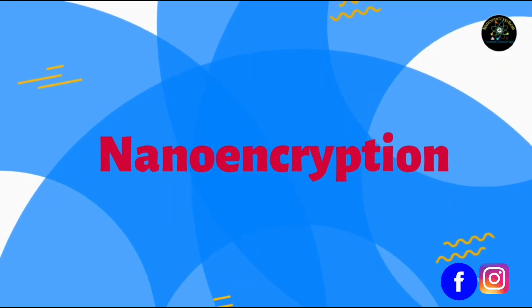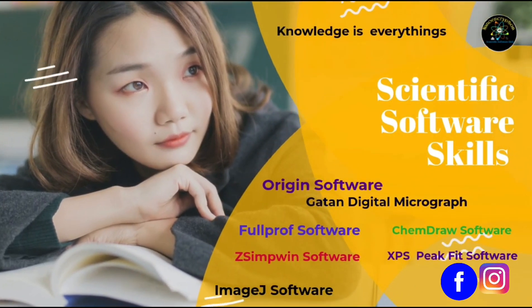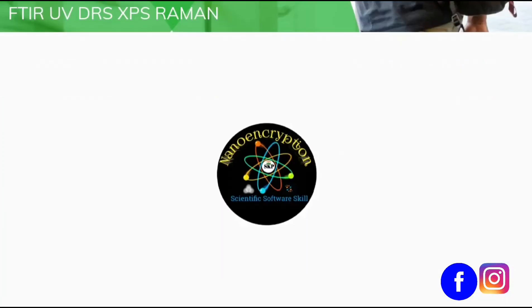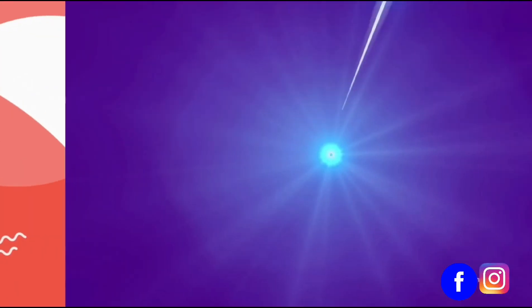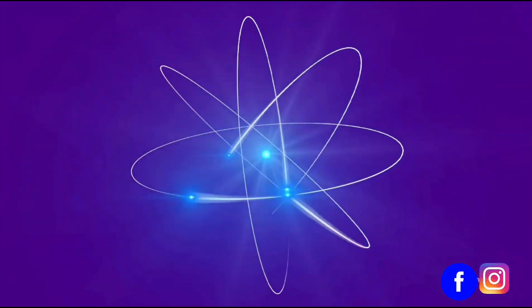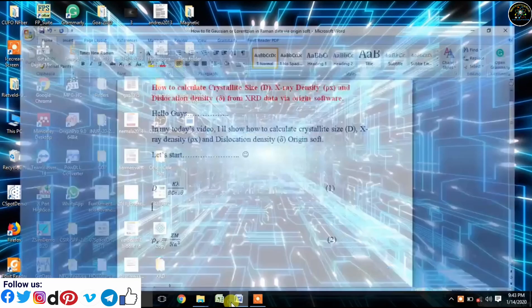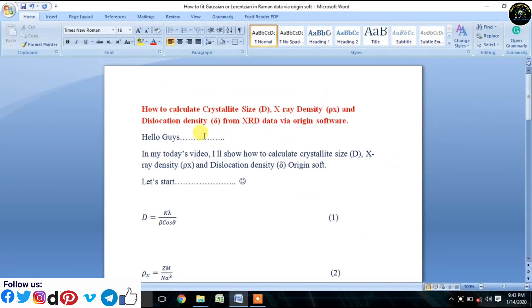Welcome to Nanoencryption. Today in this tutorial I will show you how to do estimation of crystallite size, x-ray density, and dislocation density from XRD data using Origin software. Just follow every step precisely and carefully.